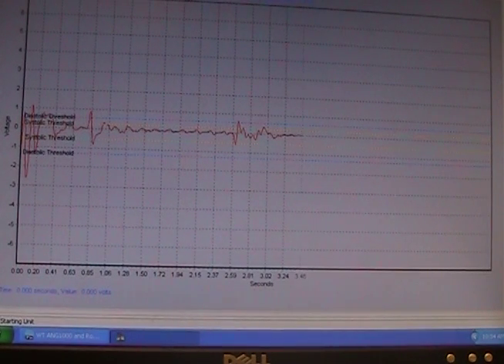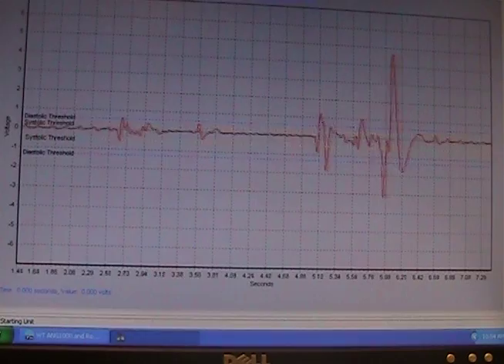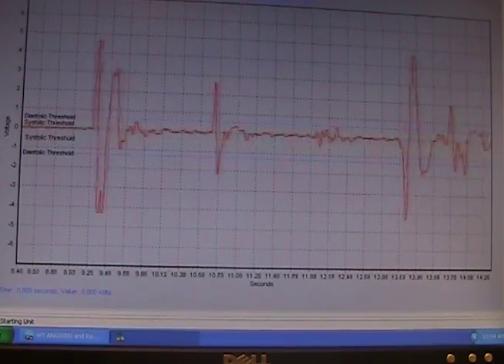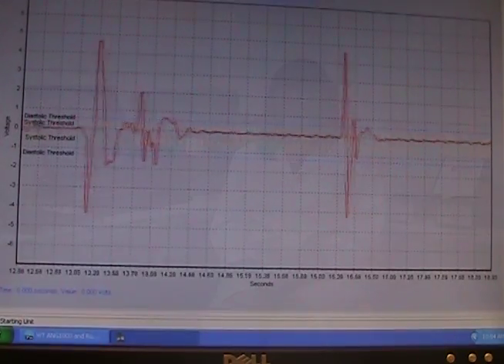During the time that the tail cuff machine is doing the blood pressures on the mouse's tail, the computer screen is actually showing the blood pressure readings, which is being shown right now. The machine takes five preliminary readings and ten actual readings. It takes ten to fifteen minutes for the readings to be done.